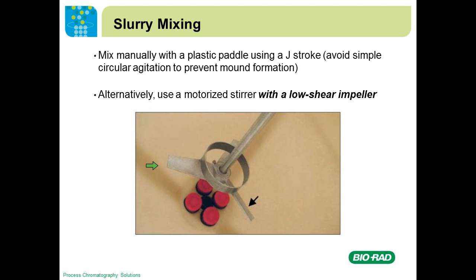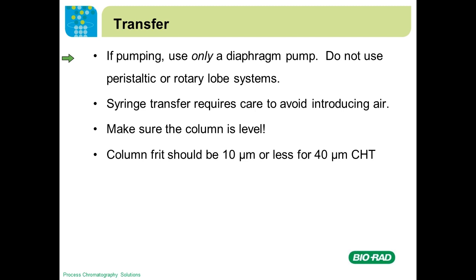We can recommend various impeller manufacturers and model numbers — please feel free to call us. If you are transferring slurry from a slurry tank into a column, only use a diaphragm pump. Do not use peristaltic or rotary lobe systems, because they will shear the CHT particles during transfer. A peristaltic pump will leave sheared particles in the column; a rotary lobe system will also score the inside of the pump. You can also transfer via syringe — a fairly popular method where you bring the column top adapter down, seal it, and pull it up to transfer from a slurry tank.